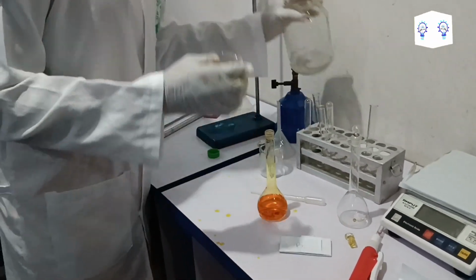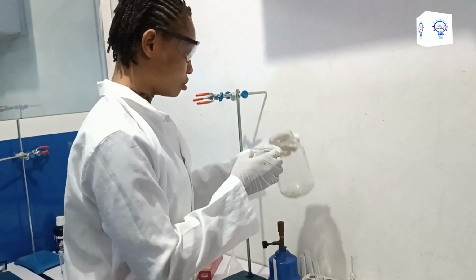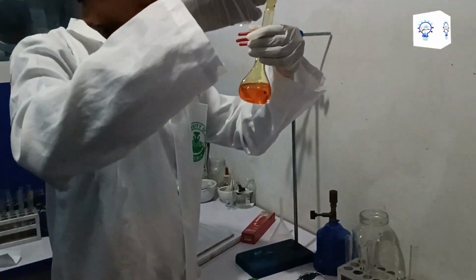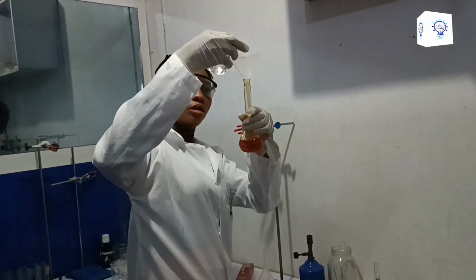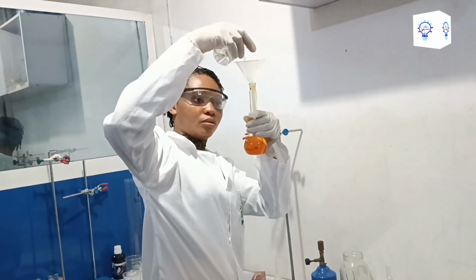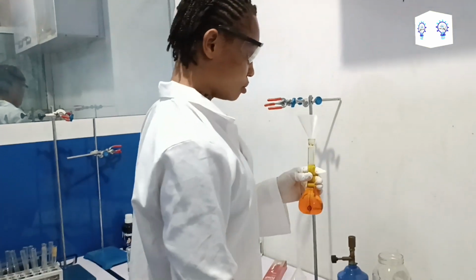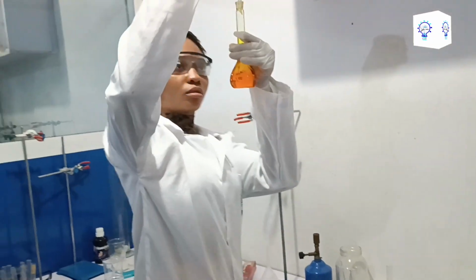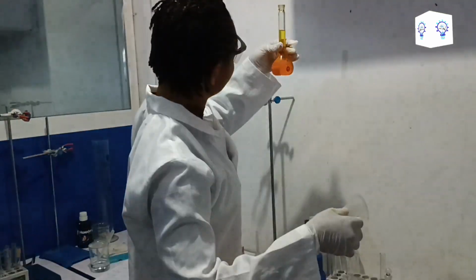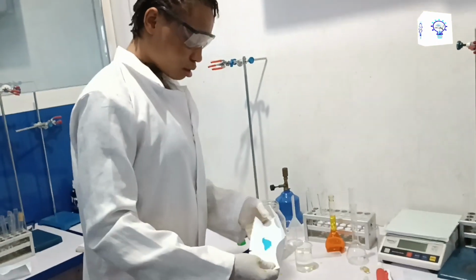I'm going to add more water to make it 100 mL. That is exactly 100 mL. Copper sulfate.